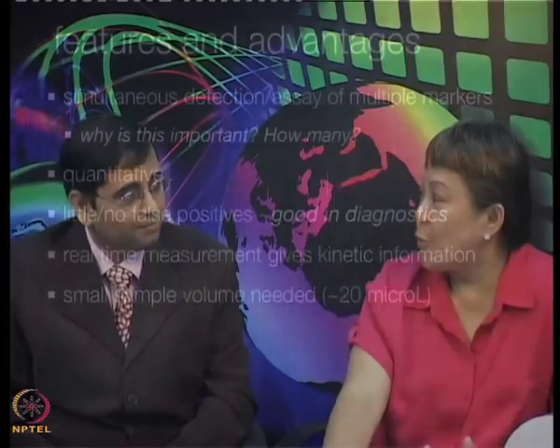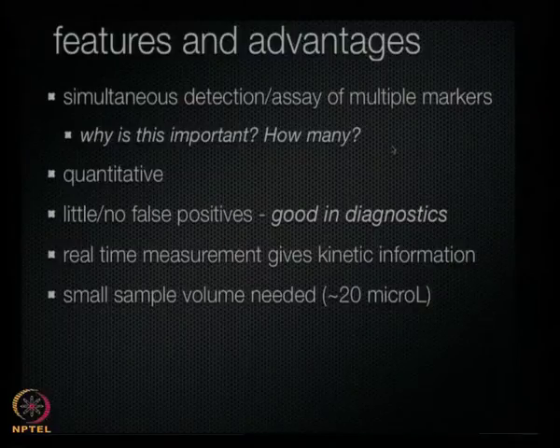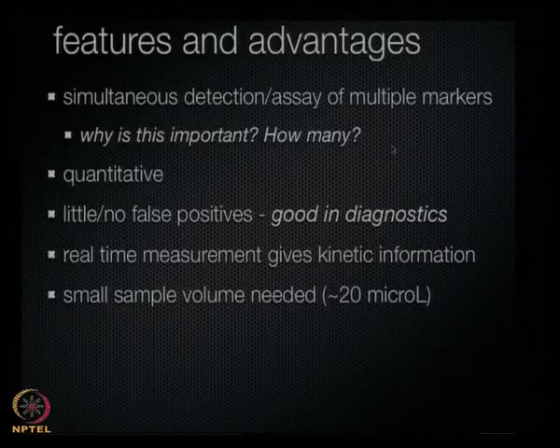In our case, though, the sample volume that's needed is very small. It all depends on how good that little sample cell is. As I said, using double-sided tape, we can get it down to 20 microliters, and that's like a small droplet. Right, I think that's very important, because if you're talking about clinical samples and measuring things in clinical settings, it's very important how low we can go. That's right. But even in your experiments in the lab, because proteins are very expensive. Yes. So the smaller the volume, the more experiments you can do cheaply. So it's always better to work in the small volume that is possible.